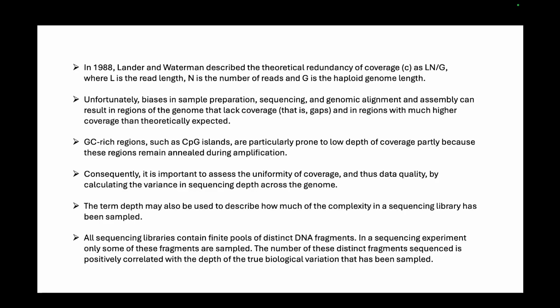So in that area of the reference genome, you'll have much higher depth, because a lot more reads have been generated compared to the rest of the genome, since in your own genome, compared to the reference, there has been a duplication of that region. That 500 base pair region has been duplicated multiple times, so your number of reads has increased there. The rest of the region has a depth of 5 or 6, and in that region it is like 50.